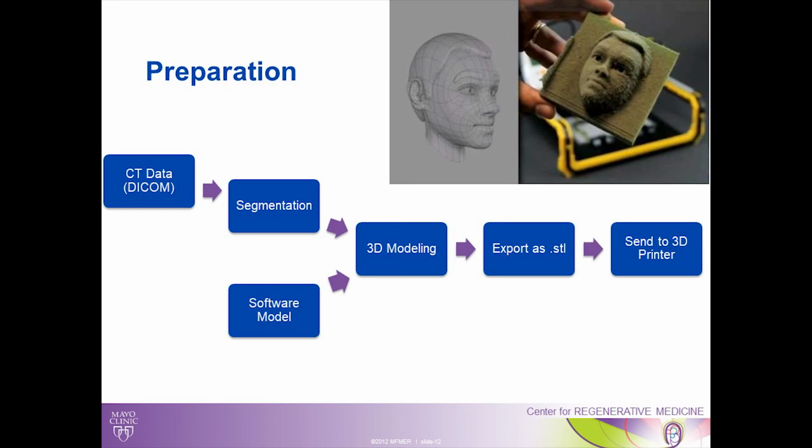I didn't really even think about that. CT scans are just kind of CT scans for me. You know they're good and you can see them. Haven't thought about that. And they want to know what's the minimum resolution that you can use for this. How do you segment? How do you get the specific cartilages and tissues and vocal folds and that type of stuff in the right areas? How do you get the program to recognize those?